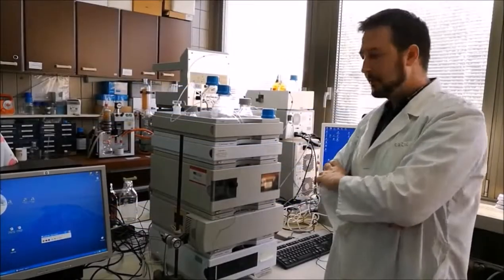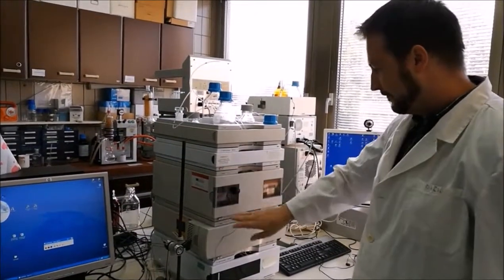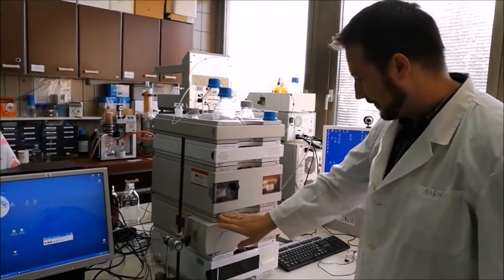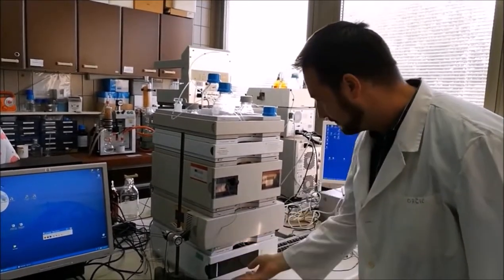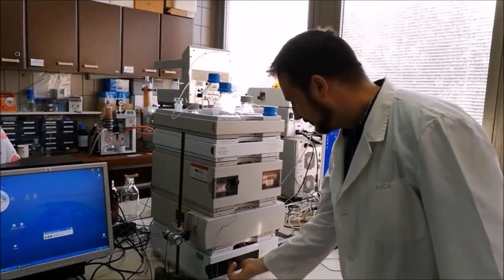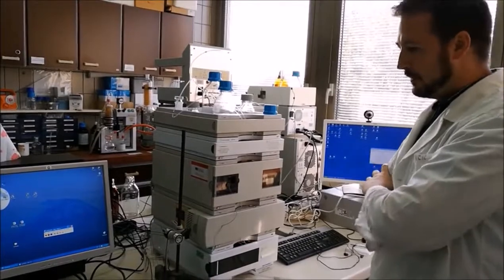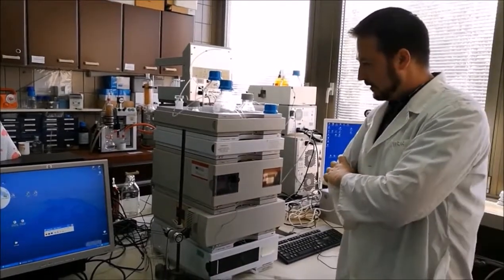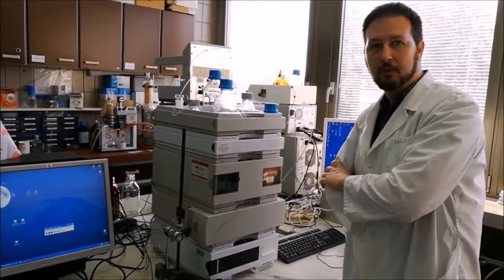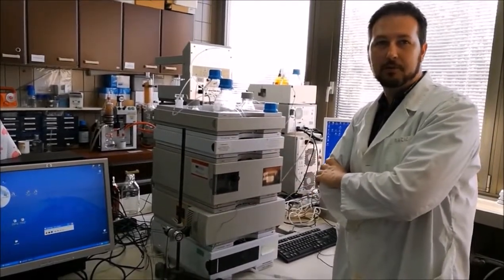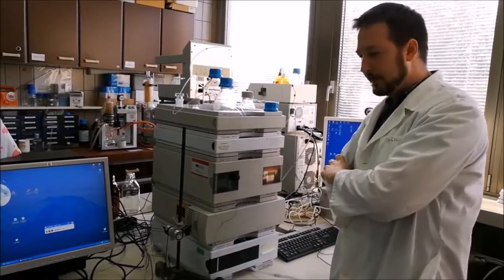The first step is, of course, to turn on the instrument. We should wait a moment until all the modules perform the auto-check.